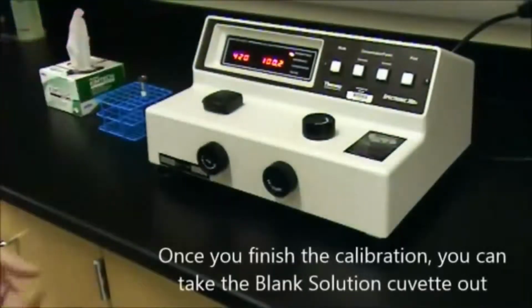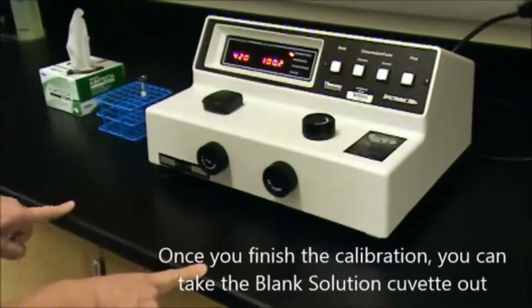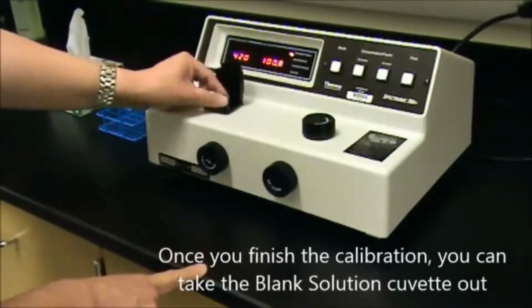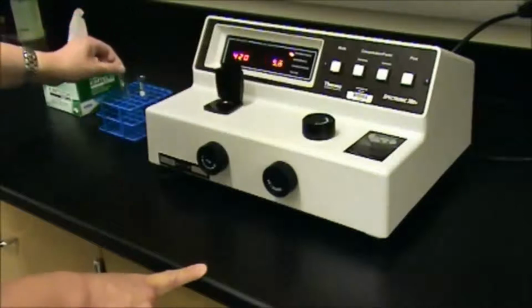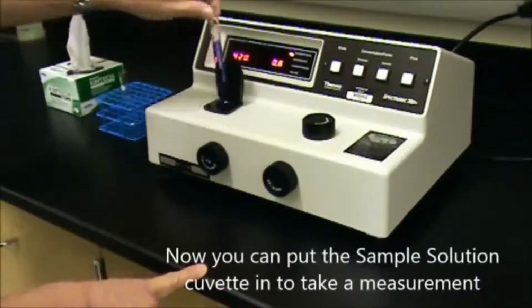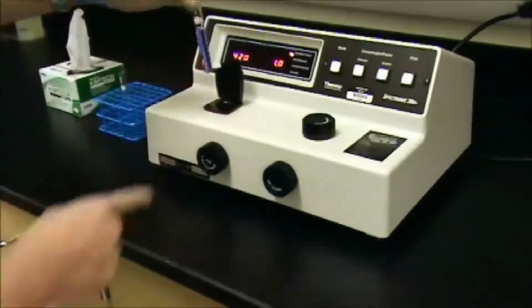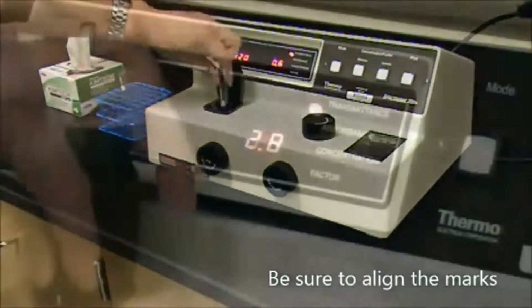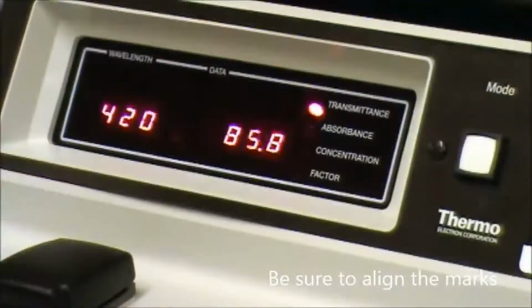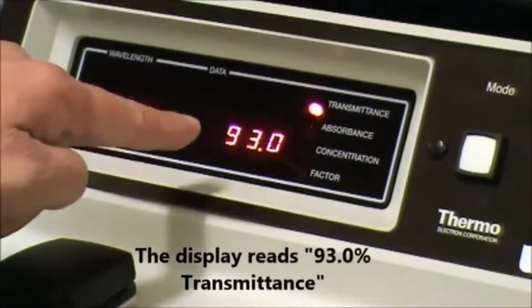Once you've set the machine at 100%, then you can go ahead and take your cuvette out and then put your sample in. Again, making sure that you line up the mark on the cuvette with the mark on the sample compartment. Here you can see that the transmittance value is 93.0%.